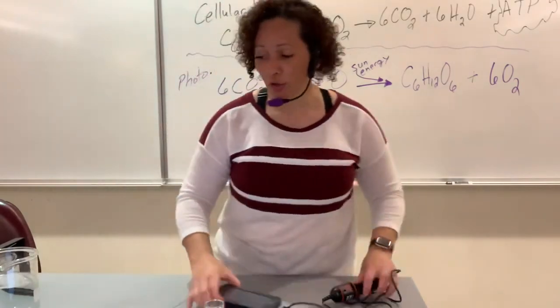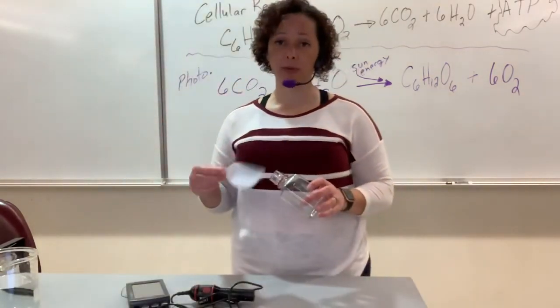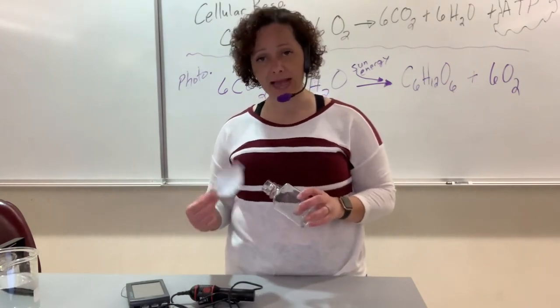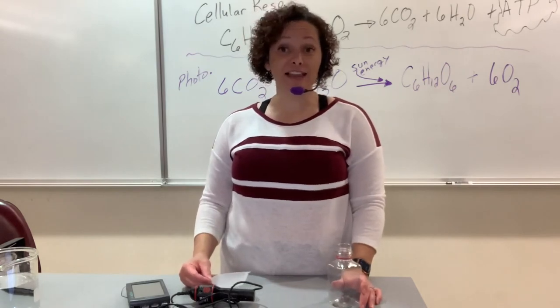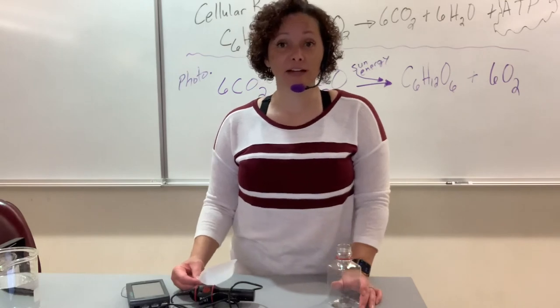Now, crucial with those animals, they need to breathe. And especially with the heavy, heavy lights that we have, they're going to get stressed. And you're going to actually see that in their respiration rate. So I guess I'm giving you some clues, aren't I?